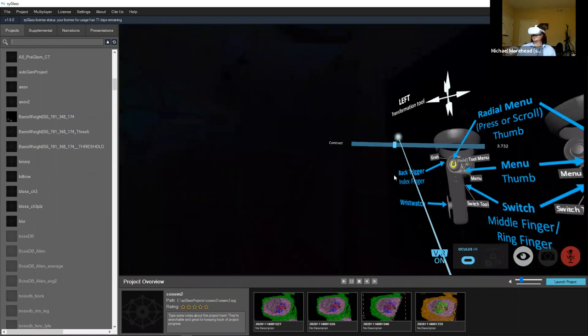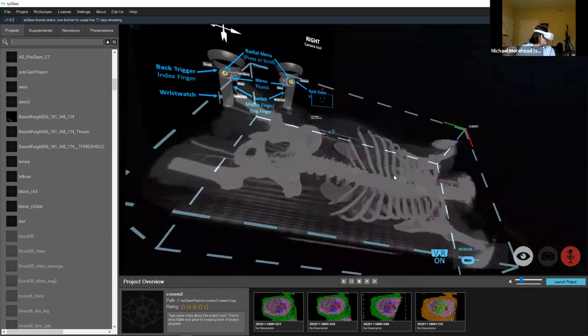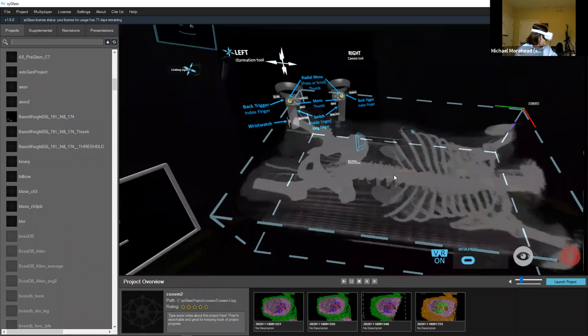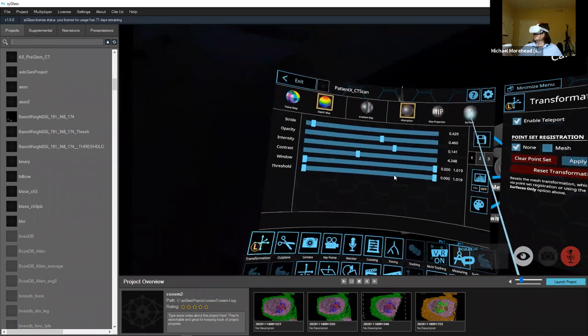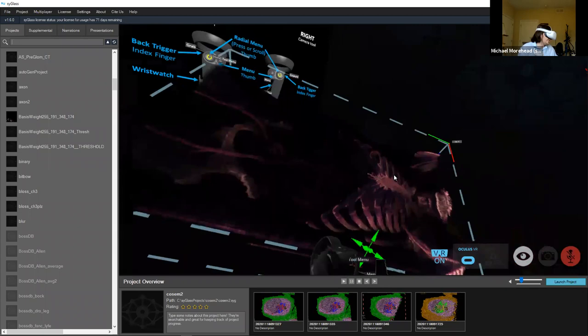We have a pseudo-surface slider, a value color map, and lots of different visualization settings available in the leader's menu.